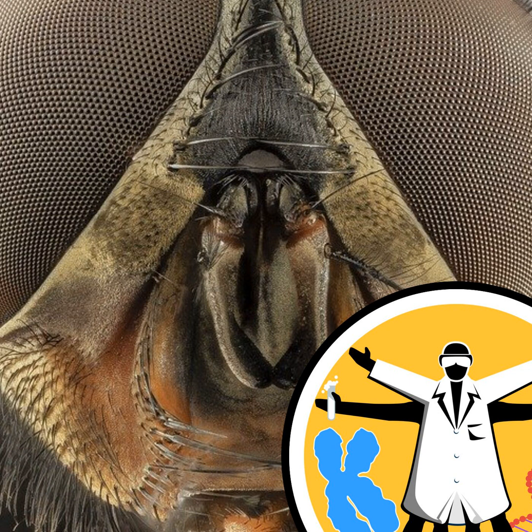Did either of them work? We were really lucky, I guess. Both of our extractions worked on the first attempt. One of the first interesting things is we thought, well, we'd compare our different extraction methods and see what we have. So for the exterior-only fly, the one we dunked in the buffer, we found that was actually enriched for an epibiont signature, which is a word I did not know until today, but that means basically things that are on the outside of stuff, which was really good. And it didn't contain an insect intestinal signature. So we managed not to get the insides of our fly into our exterior extraction.